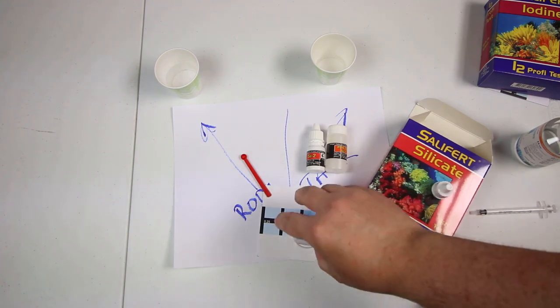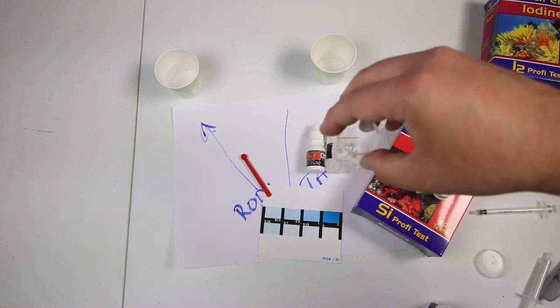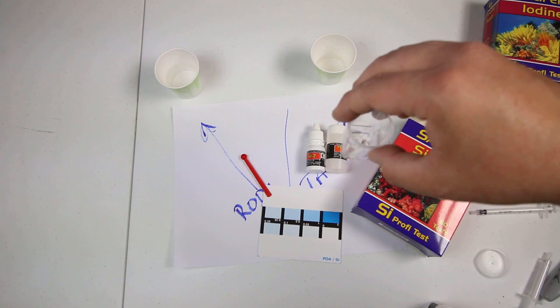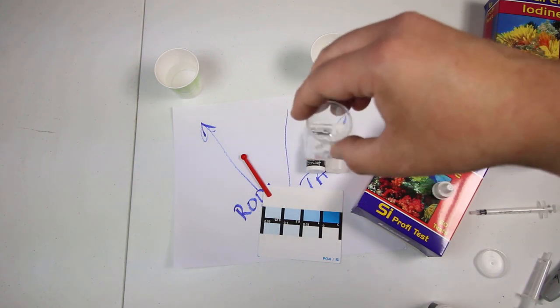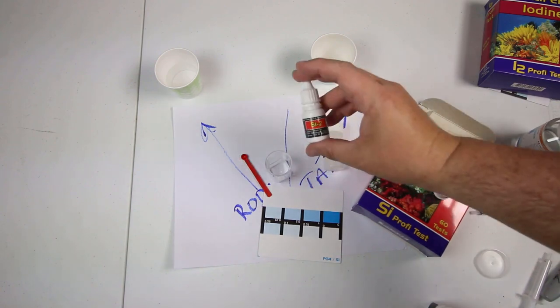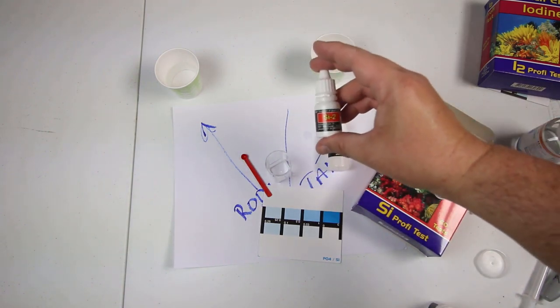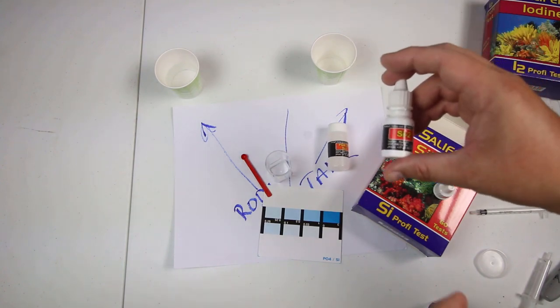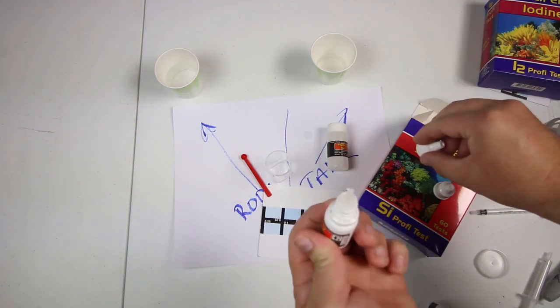We're going to gently swirl this around for ten seconds and then we're going to allow it to stand for five minutes before we move on to SI2. So now that we added that we will go to the SI2 and we're going to add another four drops. Swirl for ten seconds and this time we'll just allow it to stand for one minute instead of five.